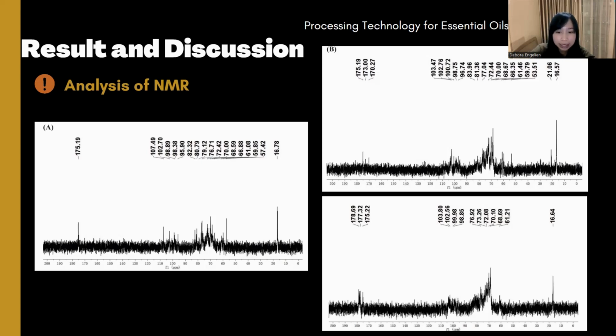Similarly, these changes were also reflected in the 13C NMR of CMGBLPS, which has a much stronger signal overlap in this region than the acetylated polysaccharide. And at the same time, two new characteristic signals at 177.32 and 178.69 appeared in the 13C NMR of CMGBLPS due to the introduction of the carboxymethyl group. And this result was similar to that obtained by the research of Yang et al.